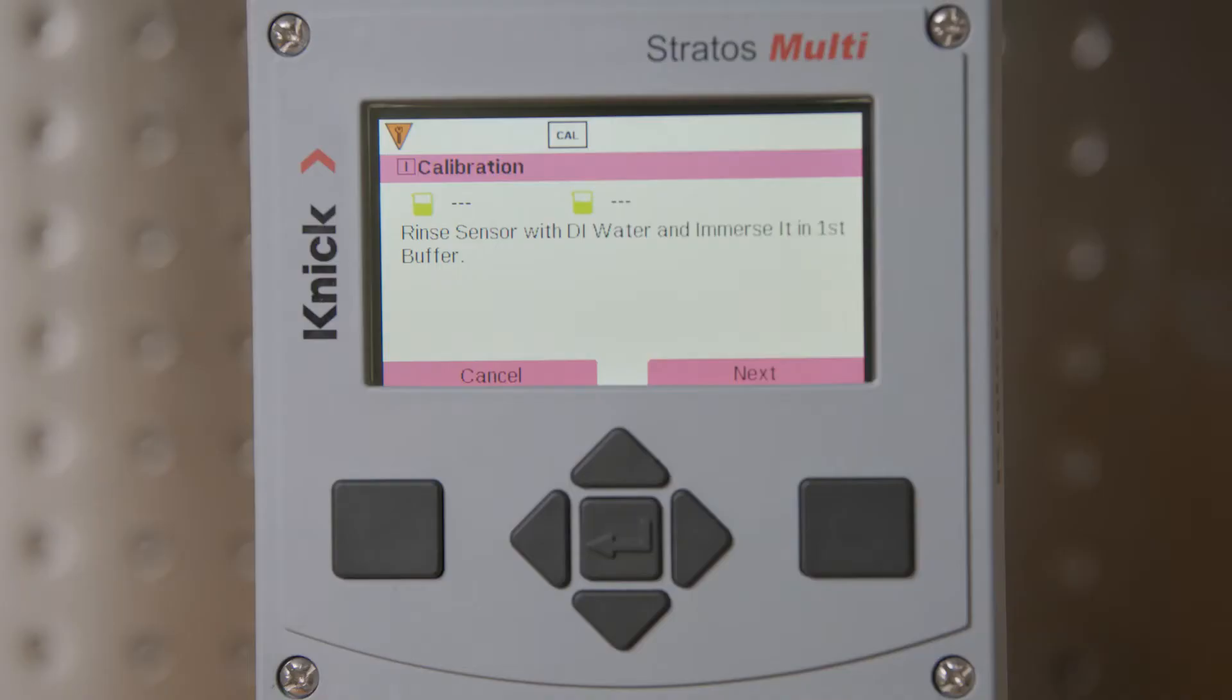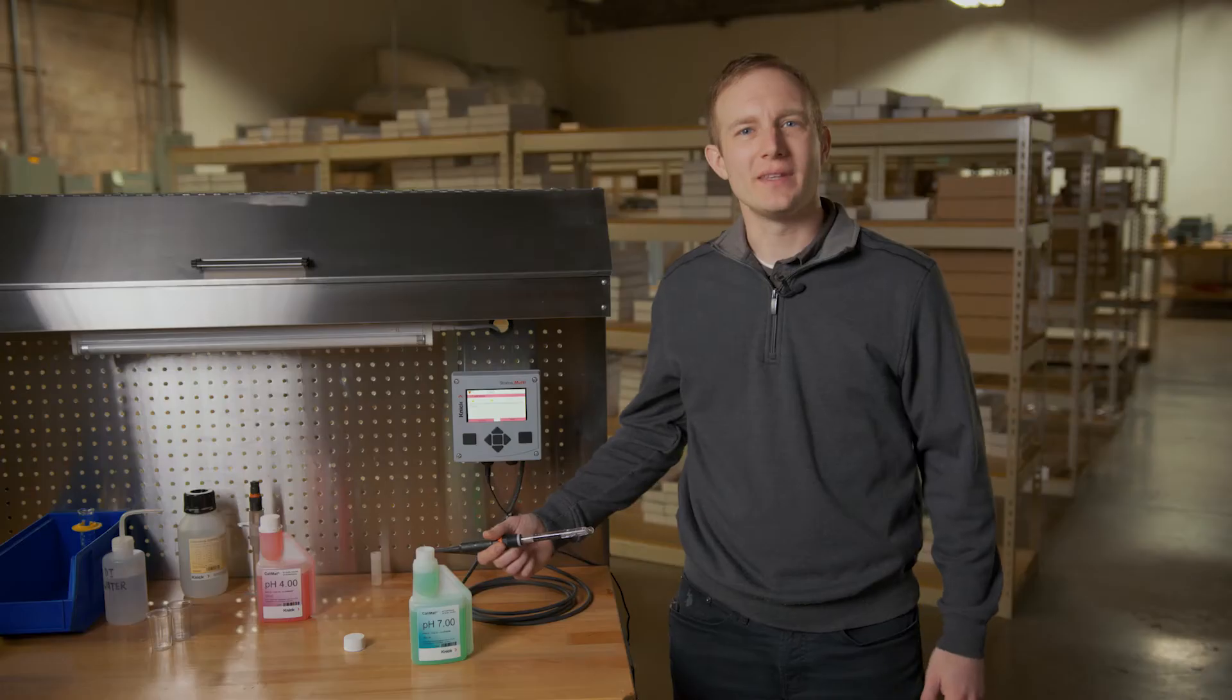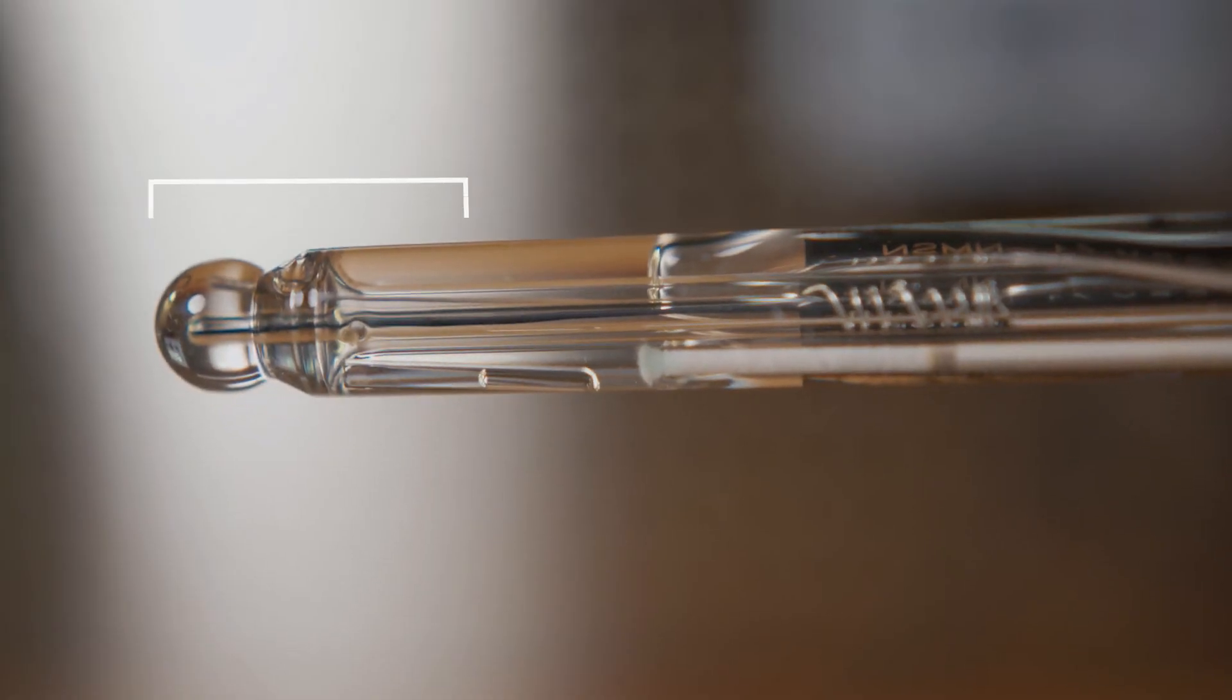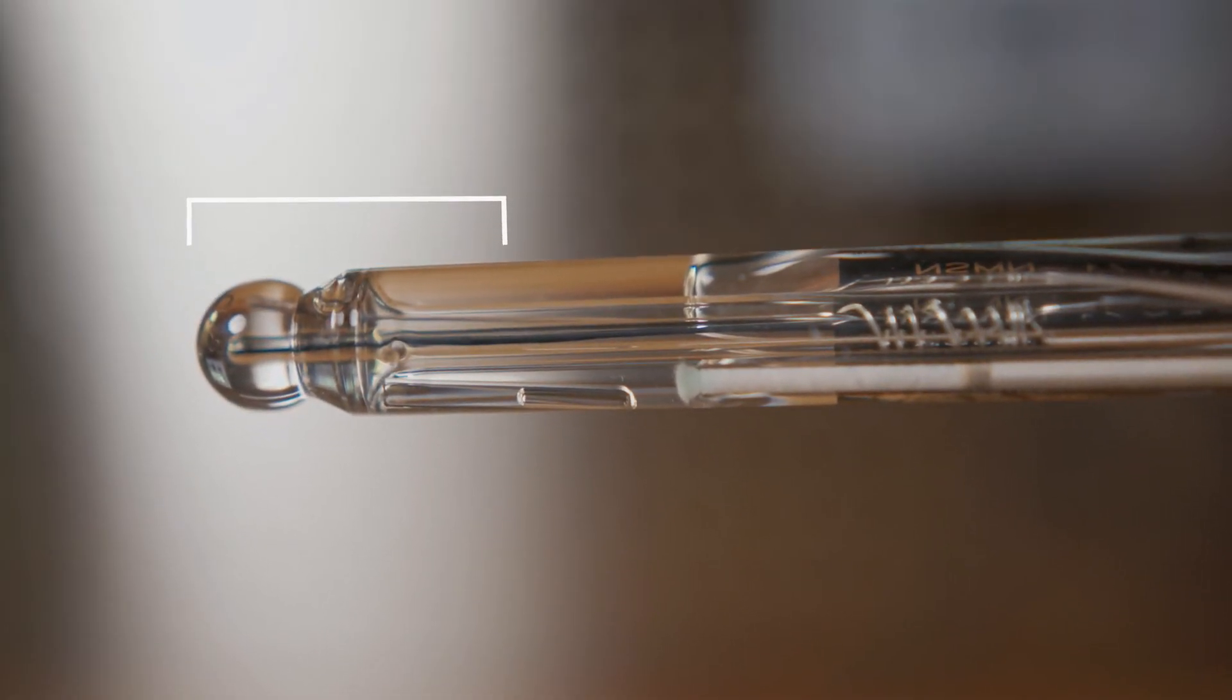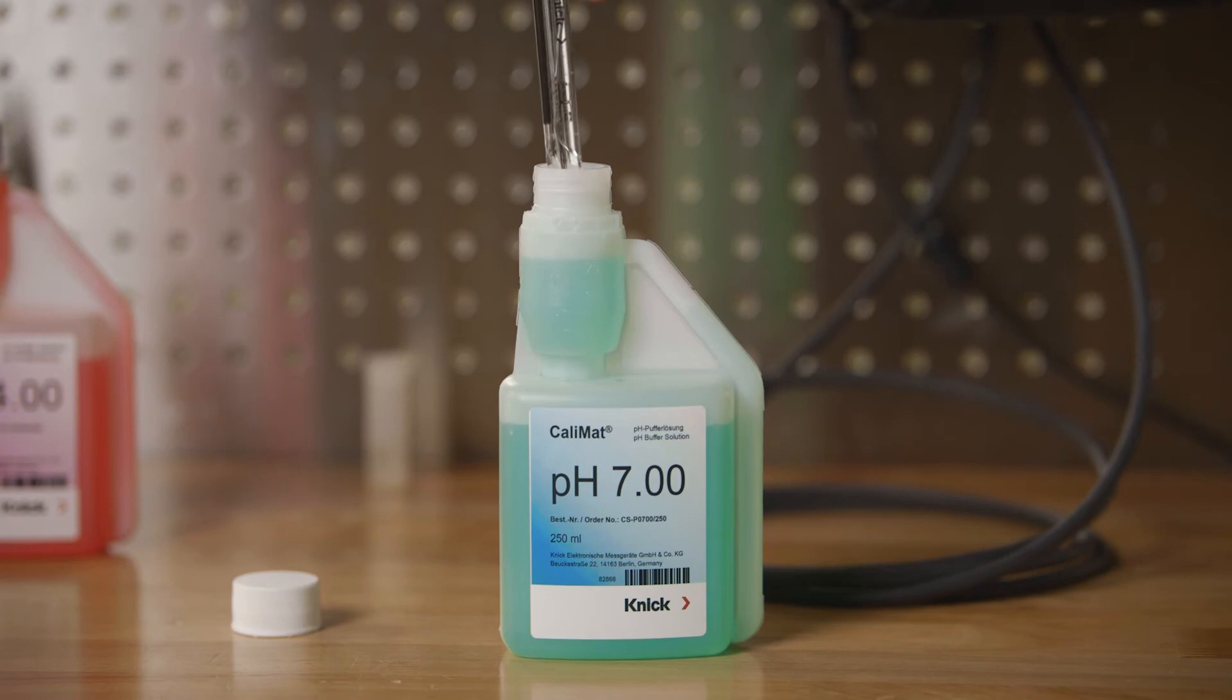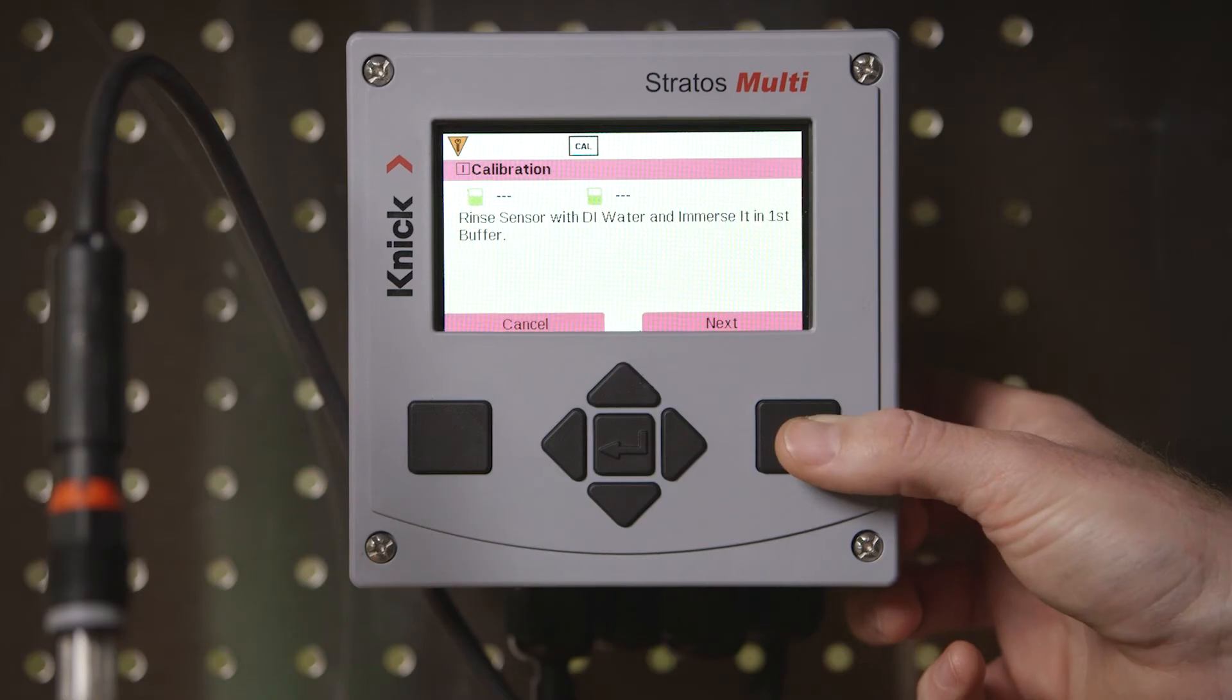Here we are prompted to rinse our sensor with DI water and place it in our first buffer solution. We will do so and place the sensor into the buffer 7. We want to ensure that the entire pH measuring bulb, along with the sensor's junction, are immersed in the buffer. We will stir lightly and then press the next button.